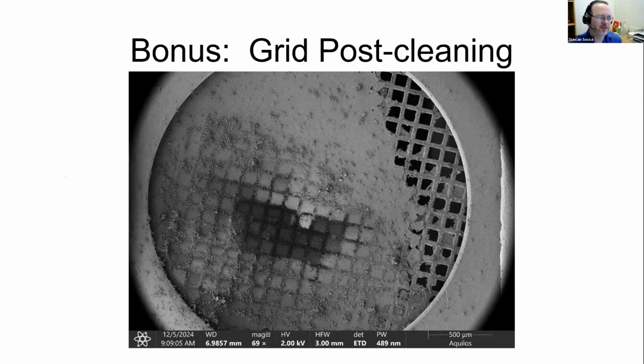This is a new project, likely. It hasn't been done before, and it's going to take a lot of work. Even for single particle, this is the case where you're constantly messing with, okay, what are my freezing conditions? Is my sample just junk? You could spend a year, 3 to 5 years working on your sample and screening. We still have to charge for that time when you're screening, even if it doesn't work out.